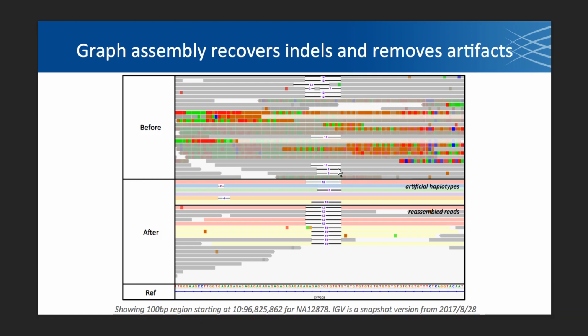And that's because each read was aligned individually without using information from the other reads. And so depending on what the start and end position of your reads are, the best alignment can look different based on the context of reads. But when you look at all of them by assembling them through the haplotype graph, then you can have more of a consensus call. And so once we run this data through the HaplotypeCaller, we're showing you the BAM output, which is an additional option you can add to your command line that'll produce a small BAM with the realigned reads. So here we're showing all the haplotypes that were recovered from the assembly graph, kind of like what we just looked at in the previous slide, and then the reads aligned against those potential haplotypes.